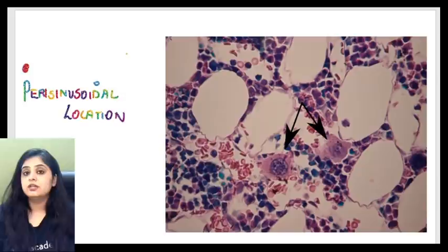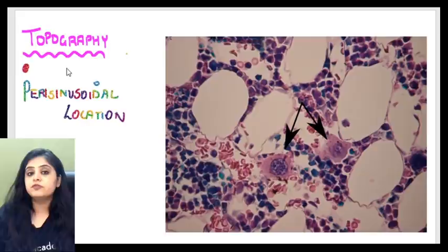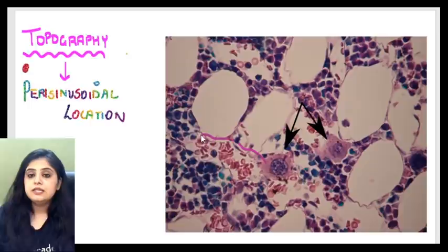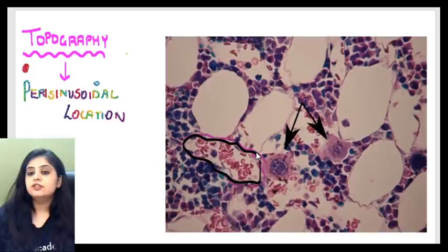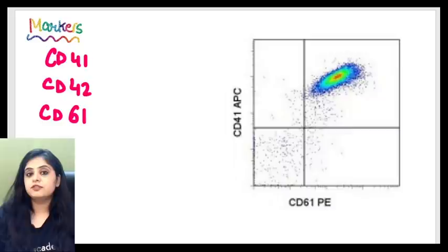Point number two: where is the megakaryocyte located in the bone marrow? The location is referred to as the topography. The topography of a megakaryocyte is perisinusoidal. In the bone marrow image you can see lots of red blood cells, indicating a sinusoid. The megakaryocytes are located just around the sinusoid — perisinusoidal in location.